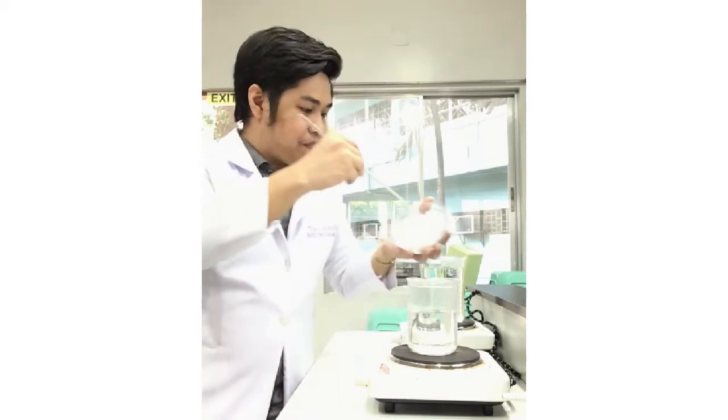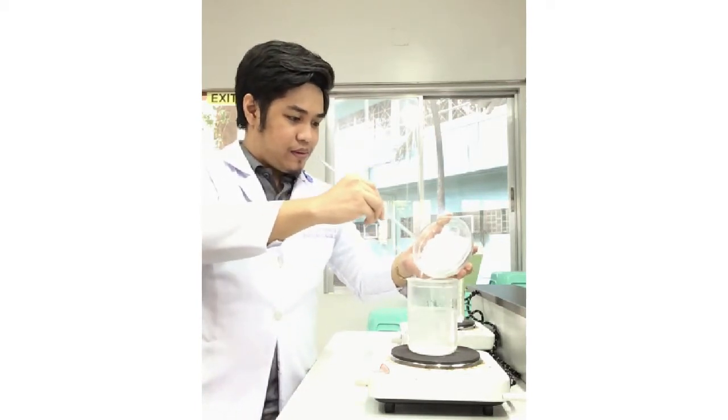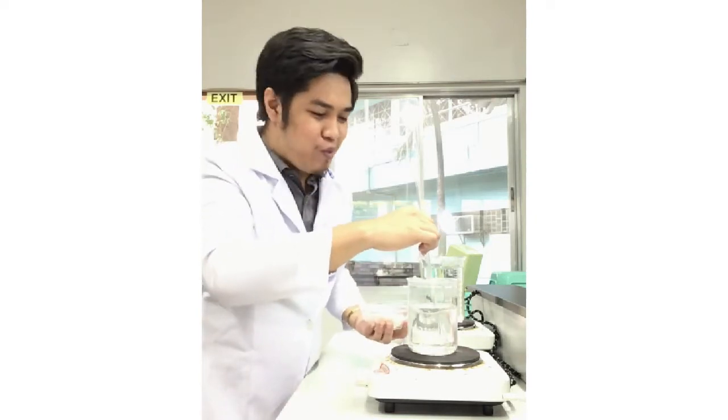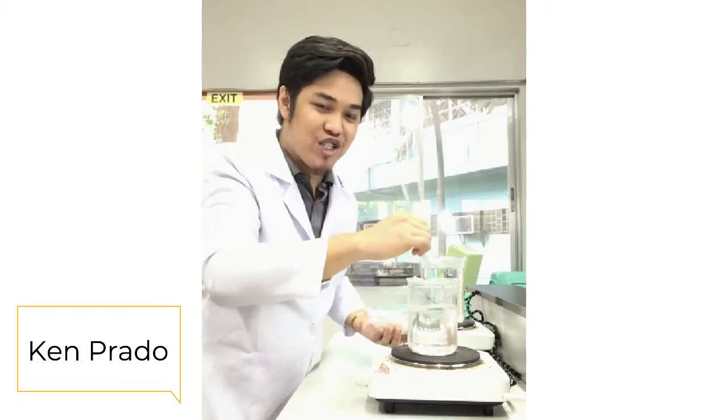To start, the first thing you need to do is to have boiling water. Once the water is already boiling, you can now add your alum powder or aluminum potassium sulfate. You need to mix it. In this experiment we will not be following those boring measurements because we want to make a supersaturated solution for us to be able to have our crystal formation.